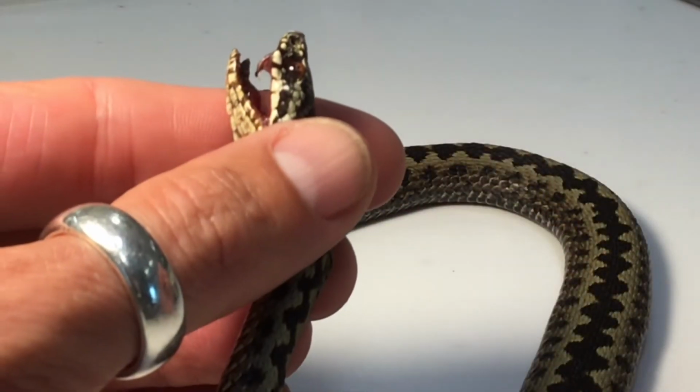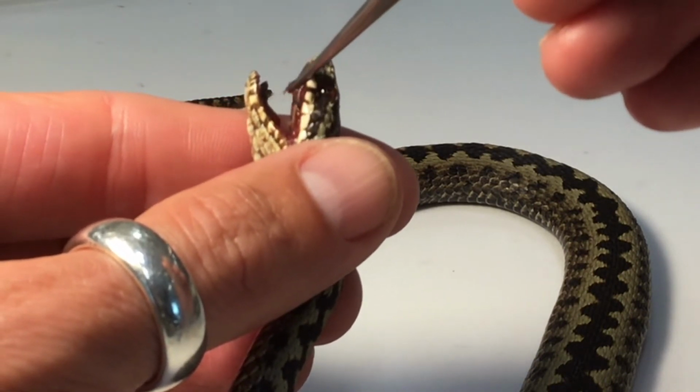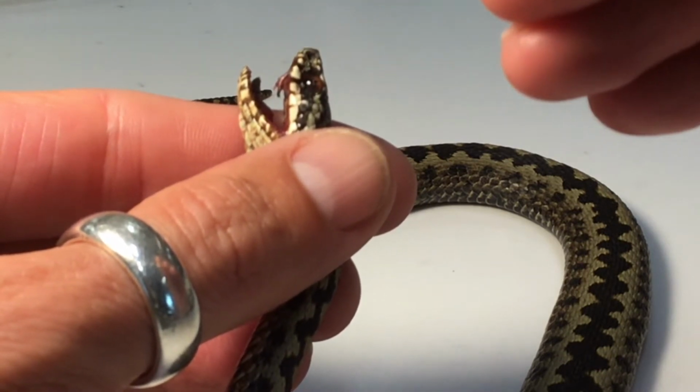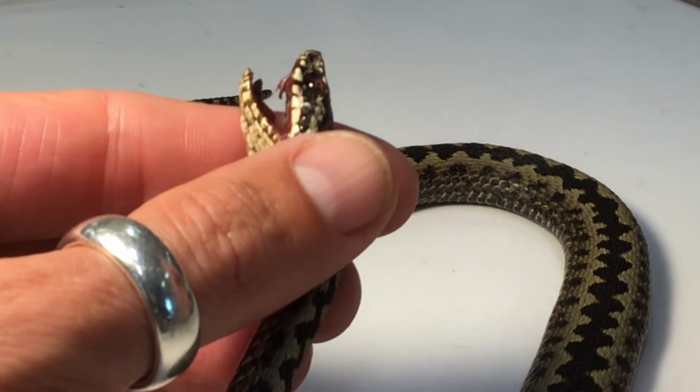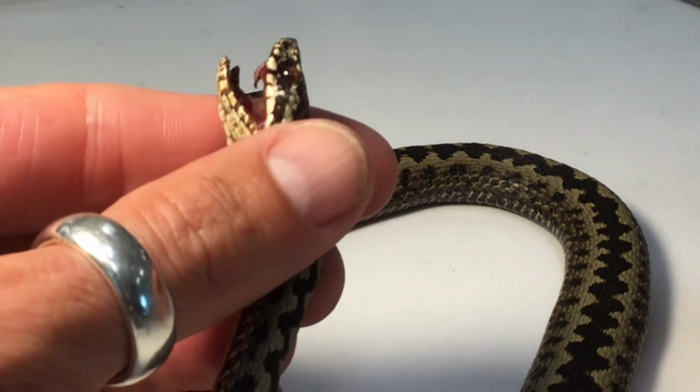Those fangs will fold back into the roof of the mouth, so they will fold up like that when the snake is not using them. And when the snake bites, the mouth opens, the fangs flick down, and it bites and obviously injects the venom into the prey, much like a hypodermic needle.